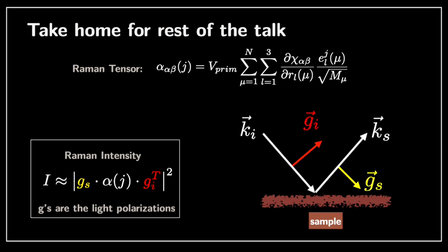Now, experimentally, of course, you do have scattering at different e_s, but with the polarizer you actually pick a given polarization. So very often you might see in the literature studies where you keep e_i the same, the incoming polarization, but you change the polarization that you actually measure. And you can get more information about your material by varying e_s.